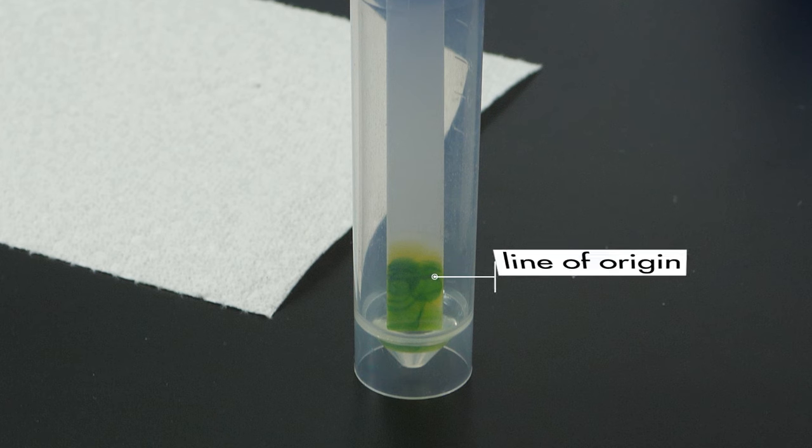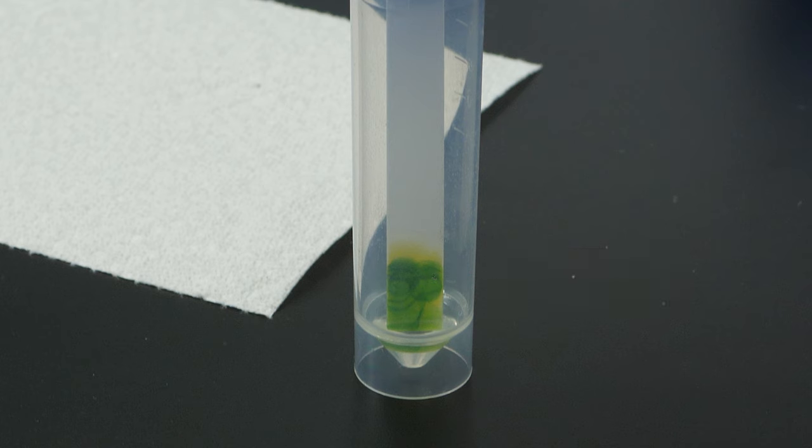As the solvent reaches the line of origin, it will dissolve the pigment and separate the mixture into some of its component pigments. Some pigments will travel quickly up the plate, but other pigments will travel more slowly.